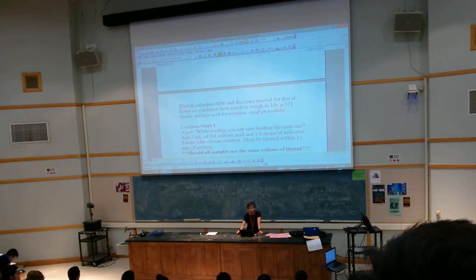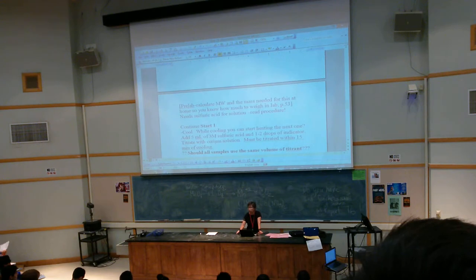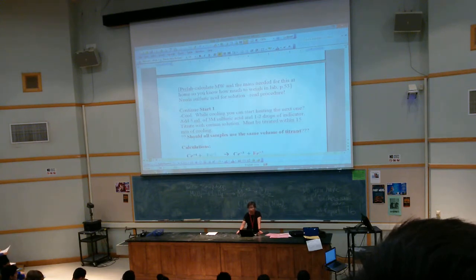Add 5 mL of 3 molar sulfuric acid, 1 to 2 drops of indicator, okay? And then you're going to titrate with the cerium salt. So where does the cerium go? On your burette. So that means your burette needs some rinsing as well with the cerium titrant, right? Okay. Should all samples use the same volume of titrant, you think?